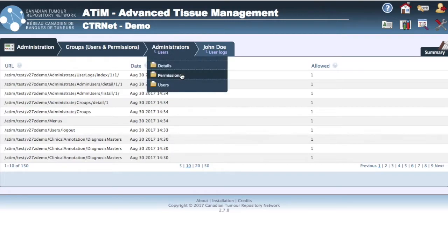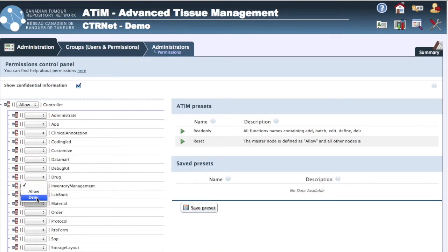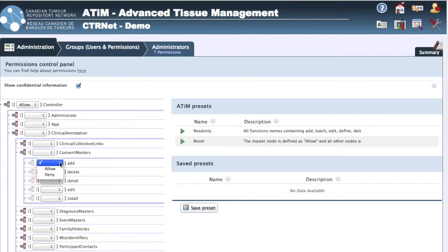Users can also have specific account types and accompanying user rules. For example, one user may have full access, while another has limited access to Atim features, meaning they can interact with the platform as read-only or in an anonymized mode.